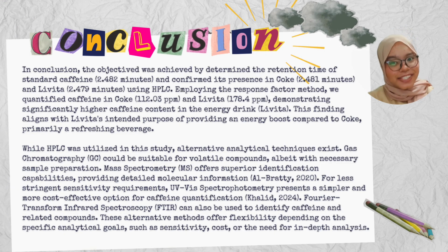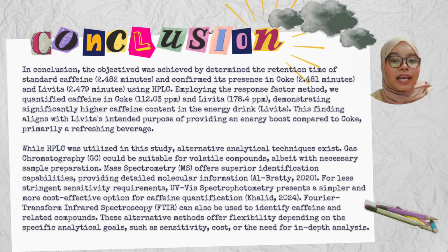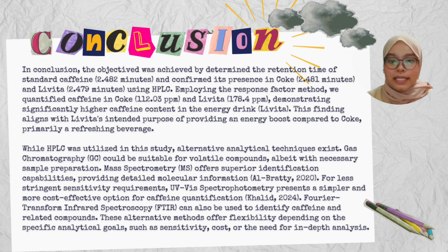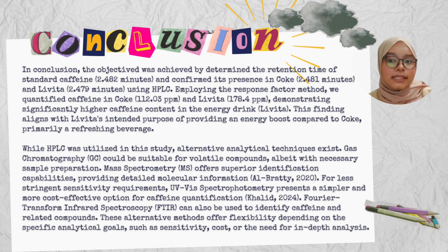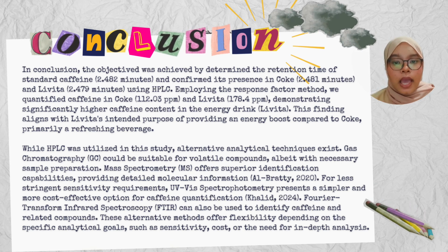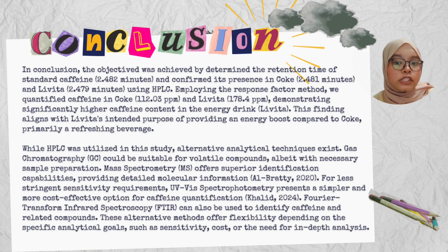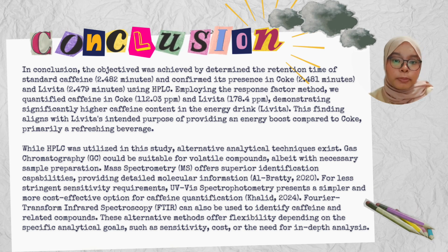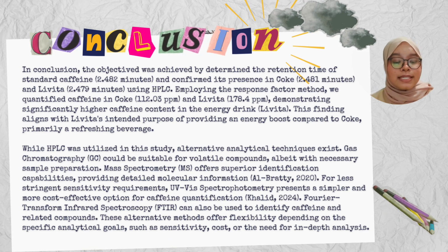Now let's move on to the last one, which is the conclusion. In conclusion, the objective was achieved by determining the retention time of standard caffeine, 2.482 minutes, and confirming its presence in Coke, 2.481 minutes, and Levita, 2.479 minutes, using HPLC. Employing the response factor method, we quantified caffeine in Coke at 112.03 ppm and Levita at 178.4 ppm, demonstrating the significantly higher caffeine content in the energy drink, which is Levita.